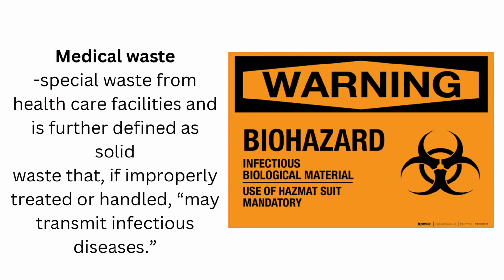As for medical waste, these are special waste from healthcare facilities and is further defined as solid waste that, if improperly treated or handled, may transmit infectious diseases. This comprises animal waste, bulk blood and blood products, microbiologic waste, pathologic waste, and even sharps.